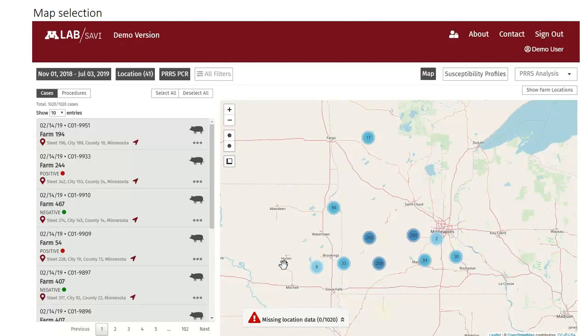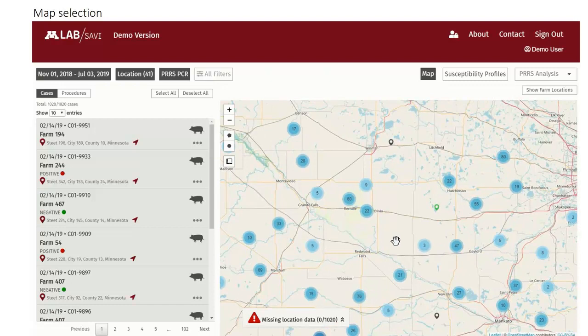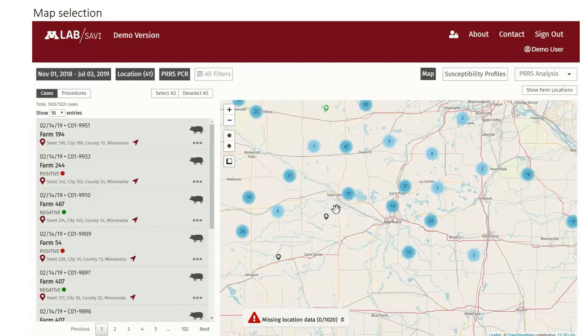If you'd rather just go right to the map, there are things you can do in the map. You can lasso an area of different size or dimension. You can scroll in and scroll out. So let's take a look at what that looks like. So here's the map. Scroll in. These balls represent cases. And however many cases there are in that density of an area, that's represented by the numbers in there. And this is an example of throwing a polygon around an area.